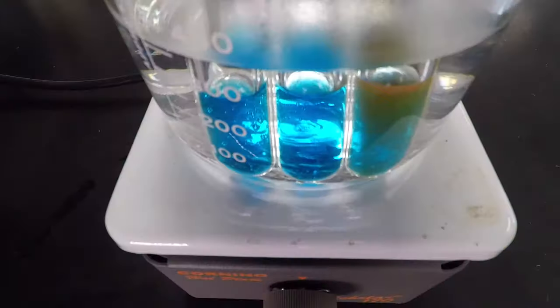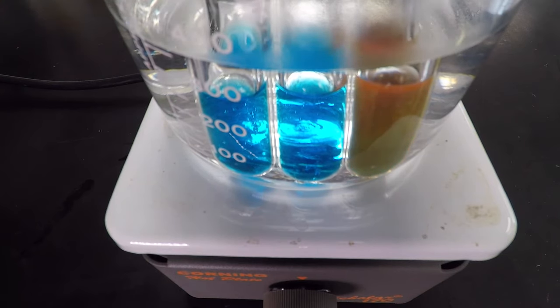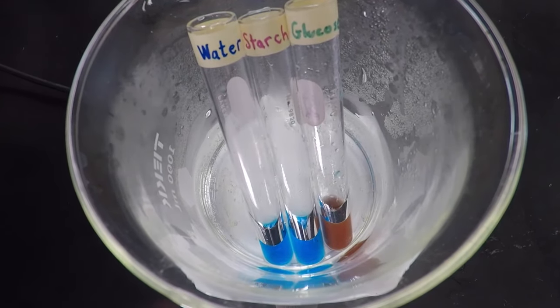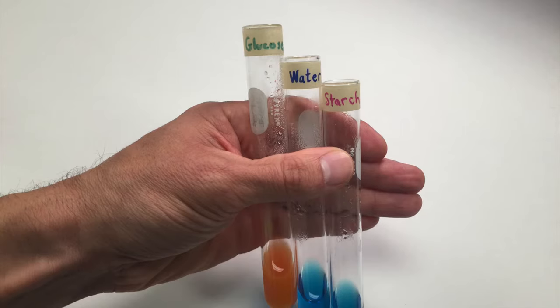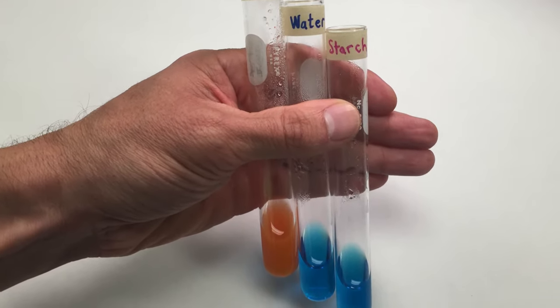I've got my water, starch, and glucose and you'll see that the glucose on the right turns brick orange and that is a positive test for sugar. The other two do not change.